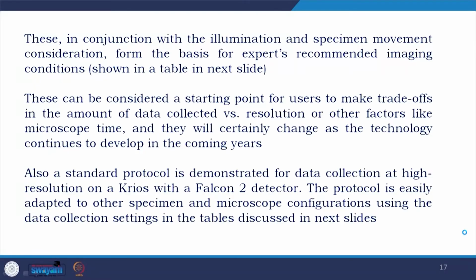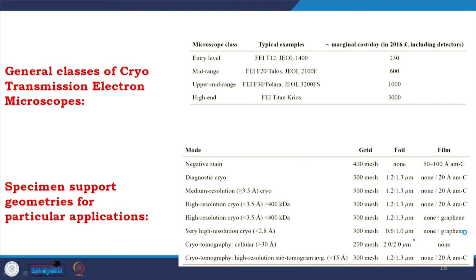Also, here I am trying to show a standard protocol for data collection at high resolution on a cryo-EM with a Falcon 2 detector. The protocol is easily adapted to other specimens. So, we are making it a target-specific protocol, but it could be easily adapted to other specimen and microscope configurations using the data collection settings we are going to discuss in the tables.